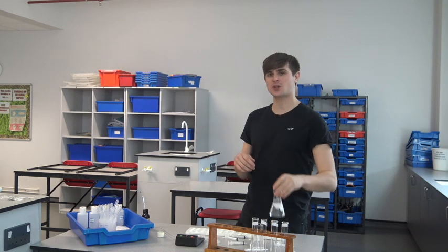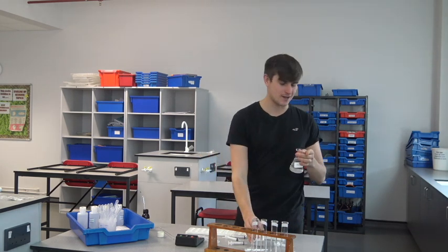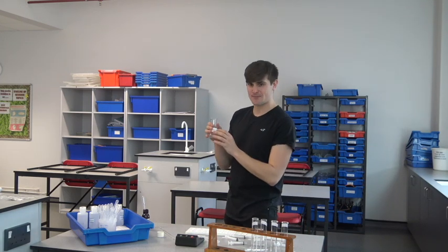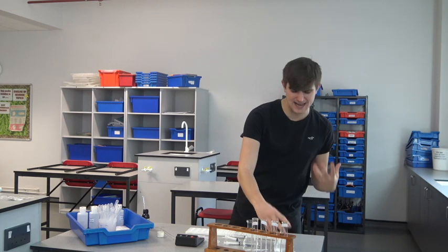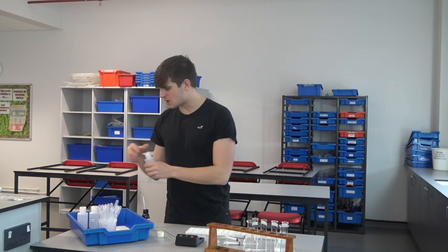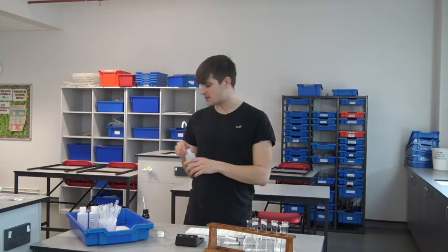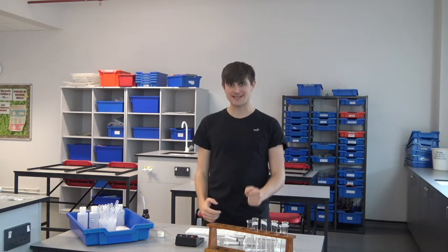I have a solution of starch which is broken down by the enzyme amylase. You need to know that amylase is specific to starch. I also have a range of different pH buffer solutions that's going to change the pH of our mixture, and we're going to see what pH the enzyme works best at.